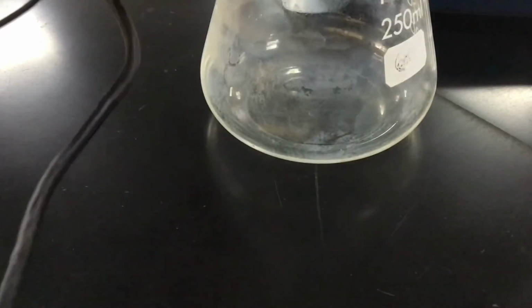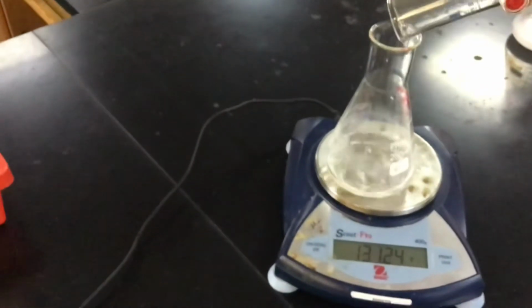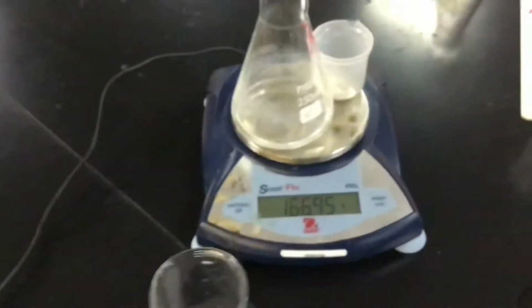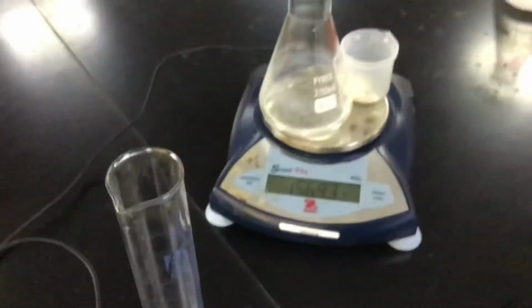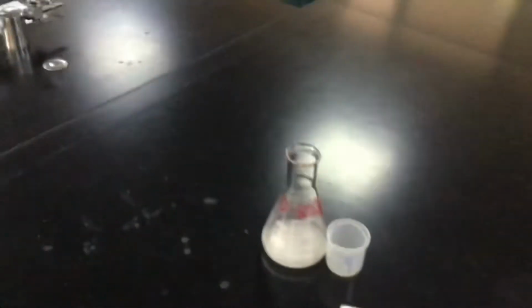So we'll have another conical flask labelled 1.5. Put the 30 ml of acid in there, and the marble chips on the scales with it. Keep that marble chip empty container next to it so we know which one was which.